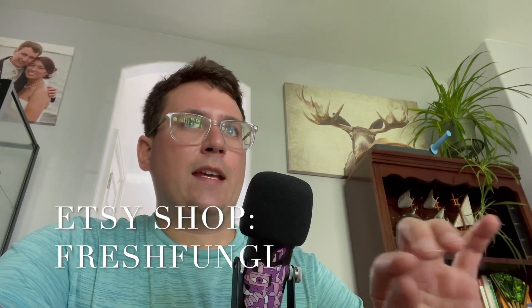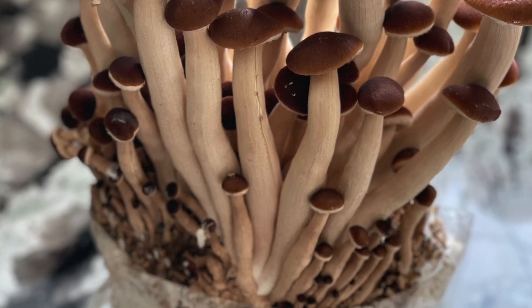One of the main issues that people often have with the bag tech is that the substrate will stick to the sides of the mushrooms as they develop. I'll go through my process and how I harvest them. For those of you who don't know, this is the bag tech method — you can grow your mushrooms inside the bag in vitro, so at least in smaller quantities, you don't need a crazy grow tent or a fruiting chamber that regulates humidity. It's all contained within the bag. Stay tuned later in the fall for our grow kits, and I'll show you how I keep the substrate off the mushrooms.